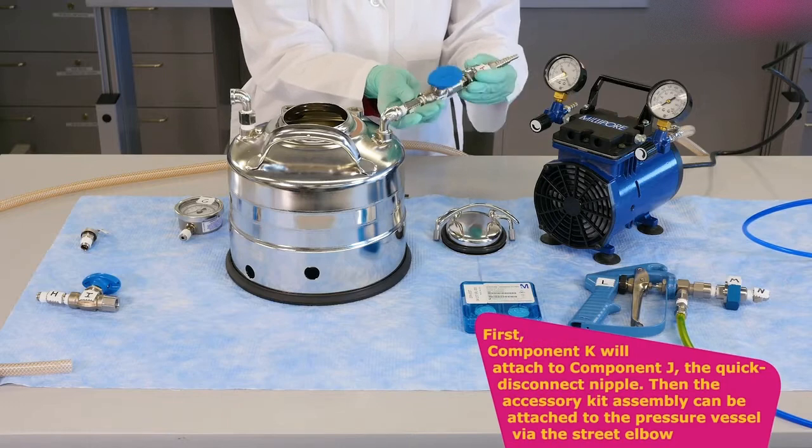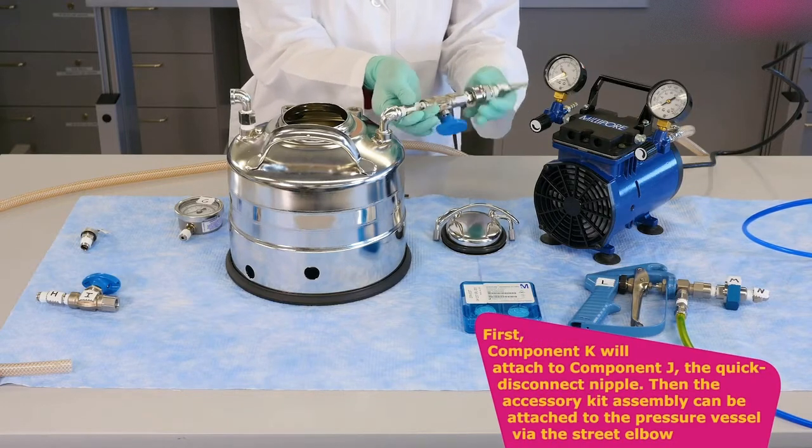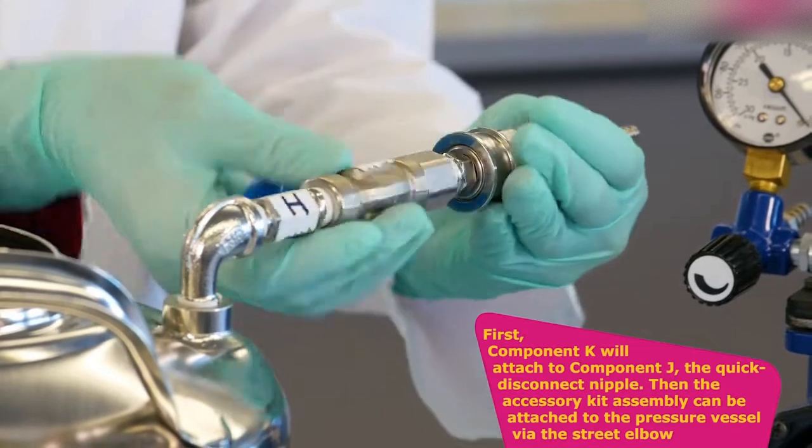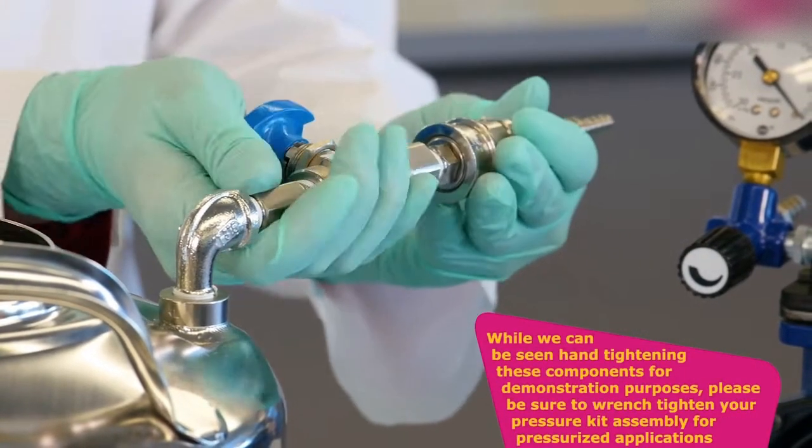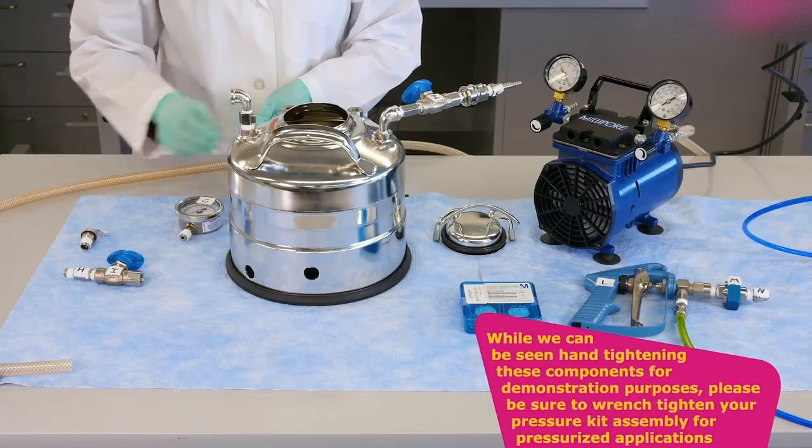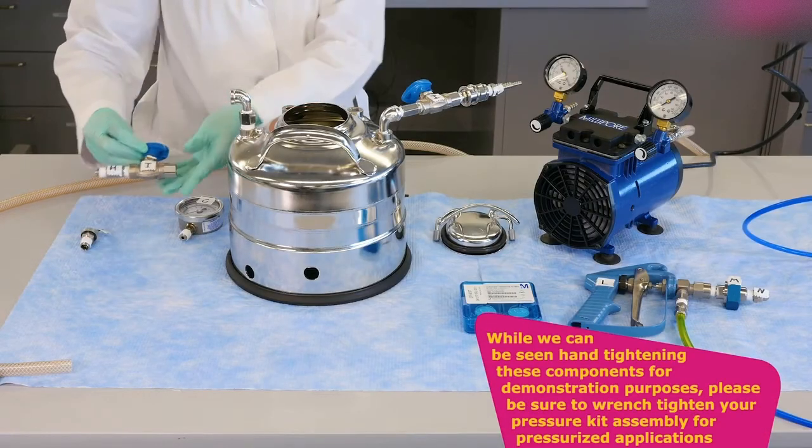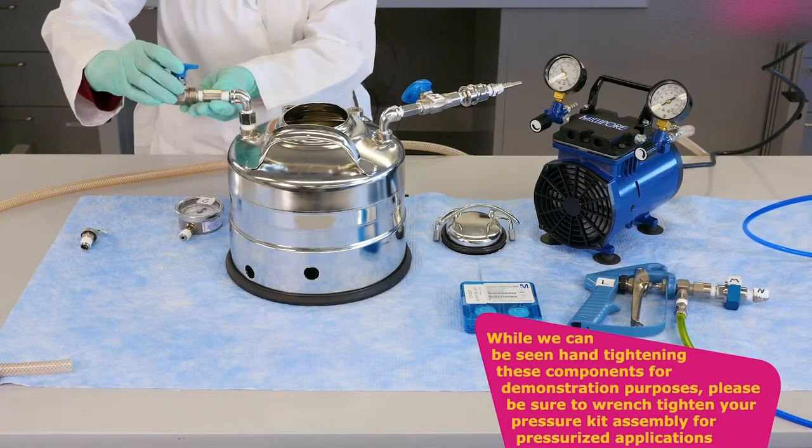First, component K will attach to component J, the quick disconnect nipple. Then the accessory kit assembly can be attached to the pressure vessel via the street elbow. While we can be seen hand tightening these components for demonstration purposes, please be sure to wrench tighten your pressure kit assembly for pressurized applications.